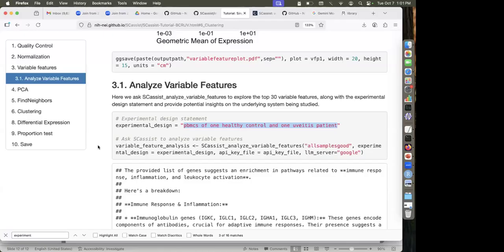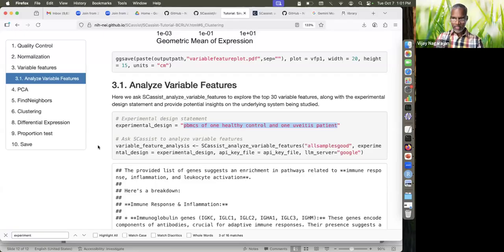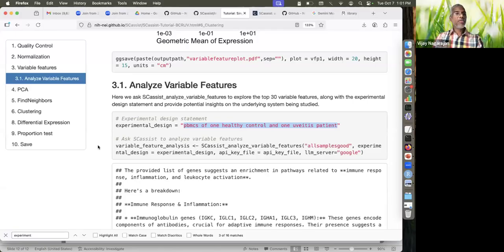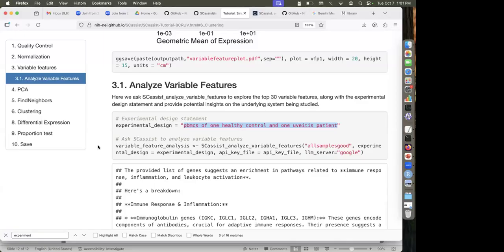Primarily I was thinking that sometimes I just don't use Seurat, but I understand that if I convert it back to Seurat, I can just use this. Thank you. That's the only option for now, but that's a great question. I wanted to say that we have version 2, where SCassist can work with CellChat objects and Monocle objects, so we potentially may be able to integrate it with other objects, including Harmony. Sounds great. Thank you. Absolutely.